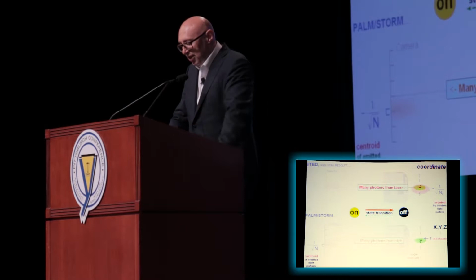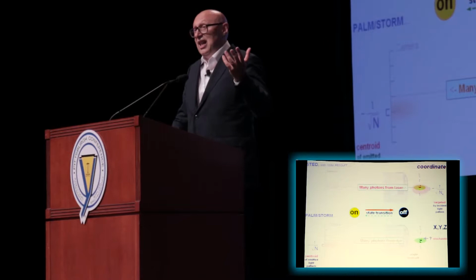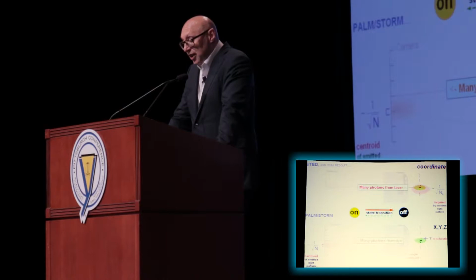Now, if you look at STED, then you realize, oh, photon number, that's not a problem, because there, instead, the positioning is done with the many photons that come from the laser. But a laser has zillions of photons. There's no shortage of photons whatsoever. I mean, you can get as many photons as you want. So defining a coordinate is, of course, much easier than in PALM/STORM.